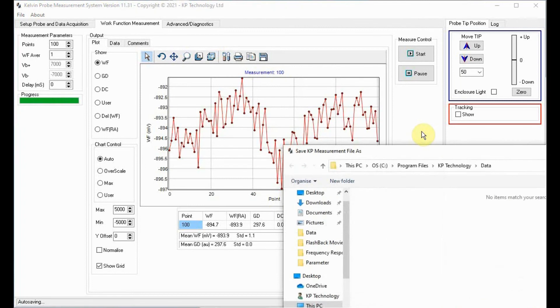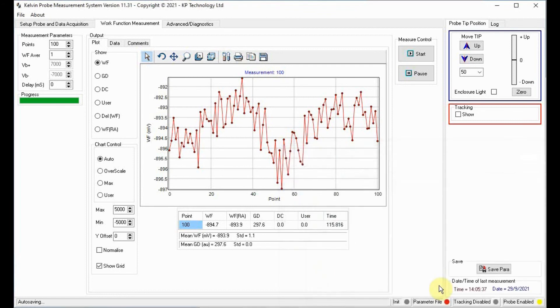When the measurement is complete you can save the file. This measurement shows the difference in Fermi level between the Kelvin probe tip and the sample.